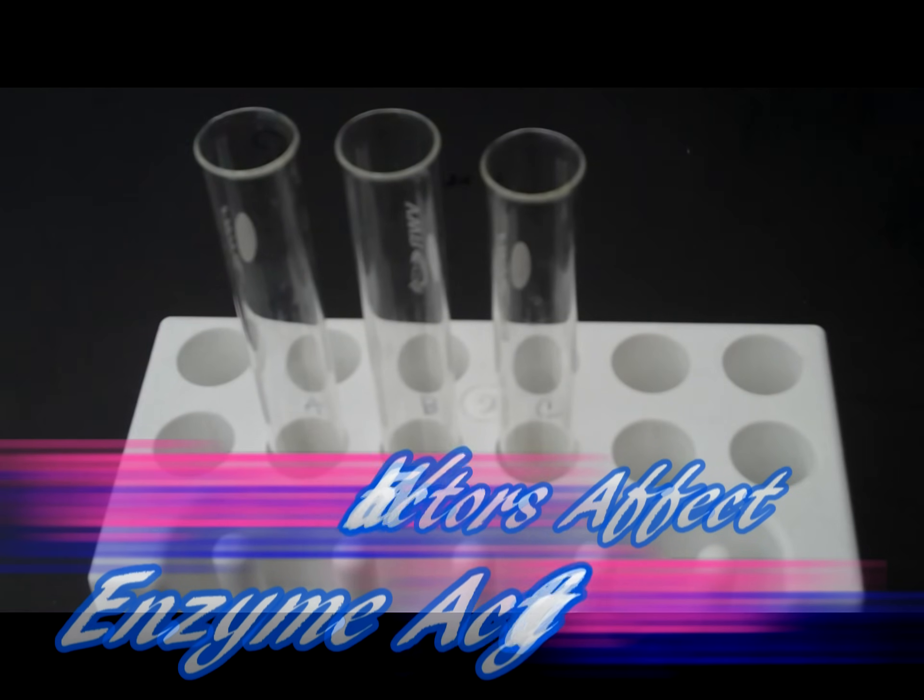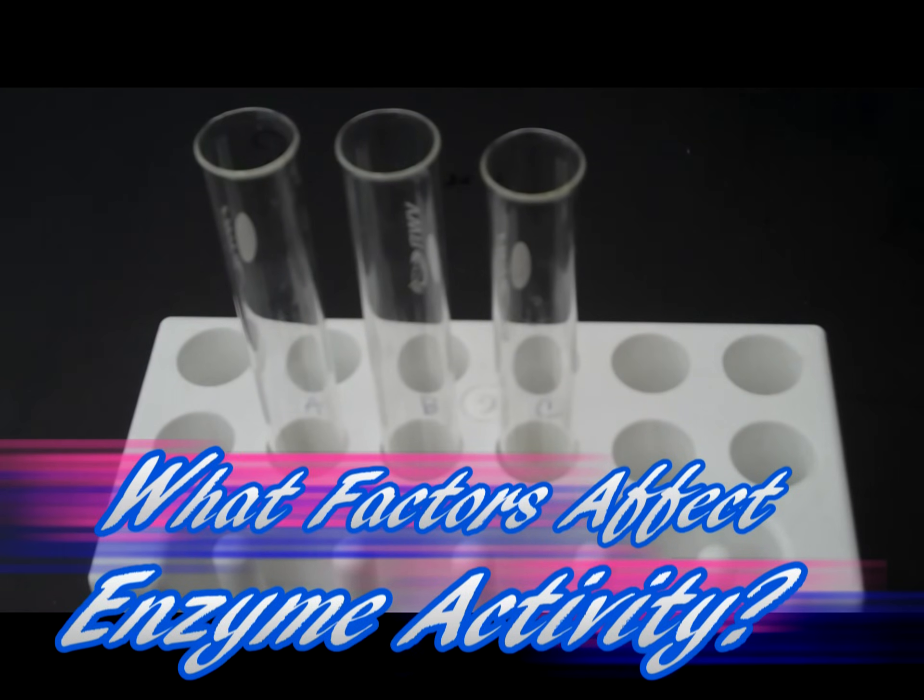Okay, so today we're going to look at how enzymes function, and we're going to test what environmental factors affect enzyme activity.